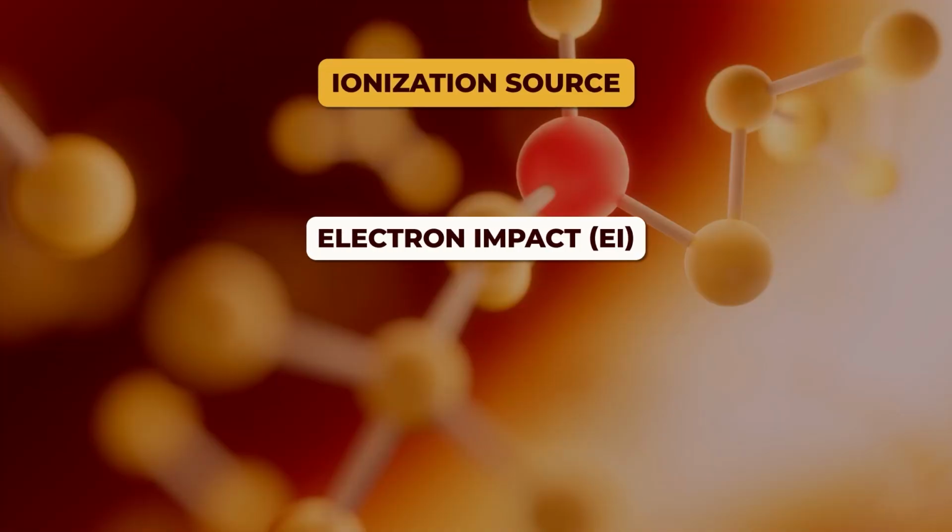What are the techniques for creating the ions? Either by electron impact, where we bombard energetic electrons, giving a fragmentation pattern. We can also ionize by chemical ionization, that is reagent gaseous ions or proton adducts. Equipment based on both kinds of techniques is available. Depending on our requirement, what kind of samples we are analyzing, we do it either by EI or by CI.